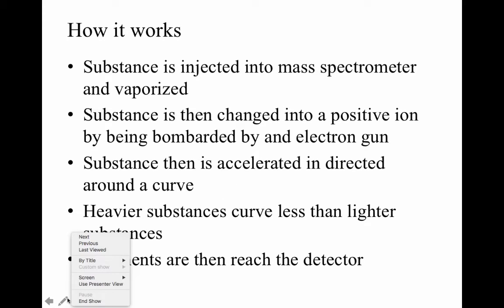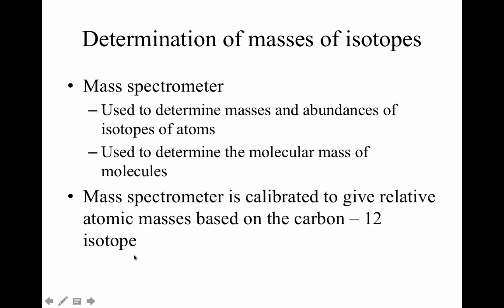The other thing that is maybe different than what we highlighted before is that with this bombardment of those high energy electrons, you do actually break the molecule apart. Last time we focused just on isotopes and atoms, but with a molecule, with that high energy electrons, you break them into fragments. Okay, and it's these fragments that are charged that are picked up in this mass spec, and kind of by working backwards, you can determine what the different components are of a molecule.